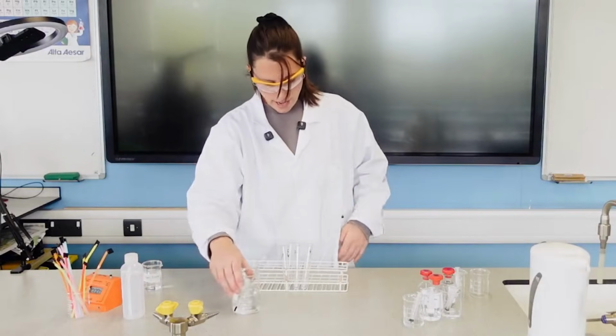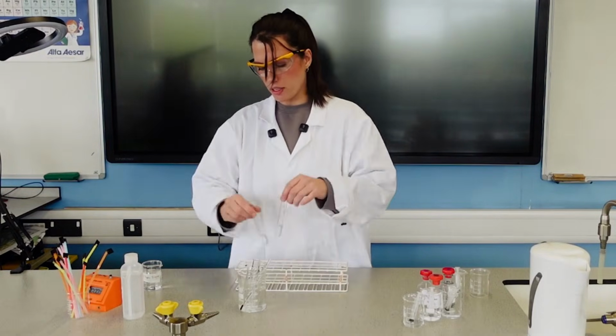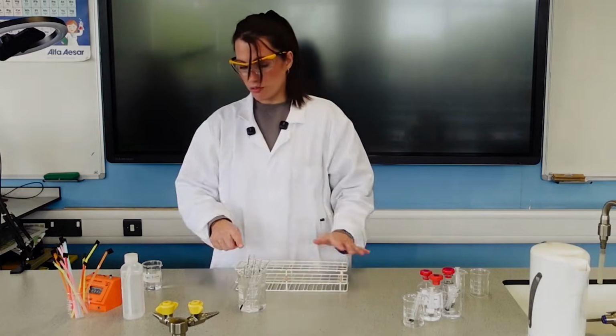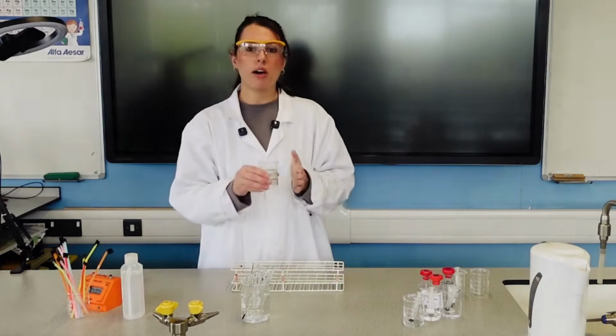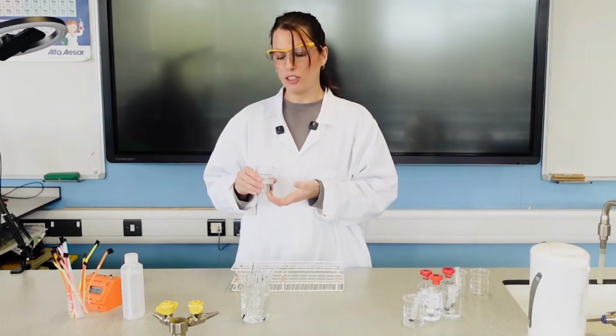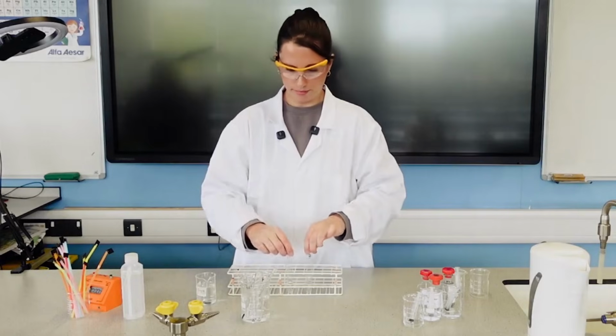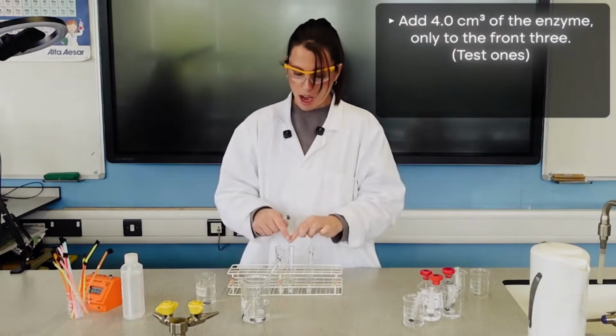Okay, so we now have the buffers in. And I'm actually going to put those in my water bath so that those are going to reach the temperature of this. And at the same time, I'm going to keep my enzyme in a separate water bath as well, so that that's going to be at 40 degrees C. Take those out.